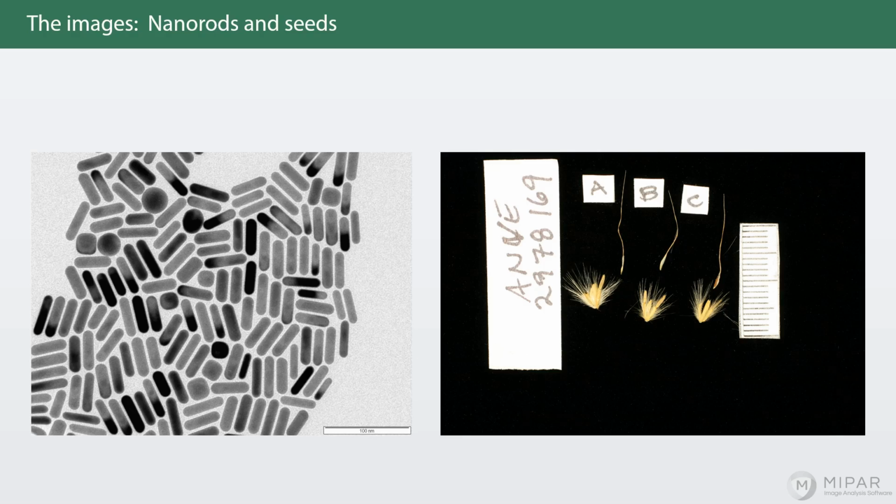Of course, it would be best if you could get an image without a scale bar burned into it. That's not always possible. You don't always have access to the original data. And then often in doing field work, you do need to have this sort of labeling in the image just to make sure that images don't get mislabeled, mixed up, that kind of thing.